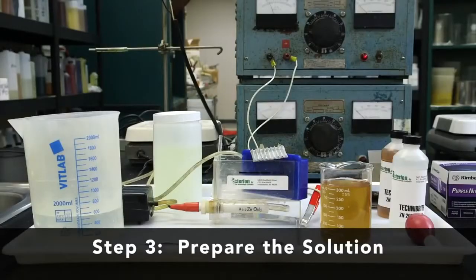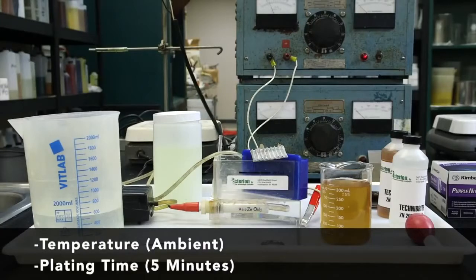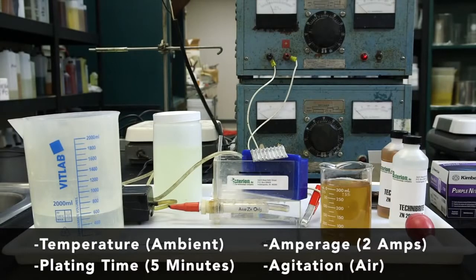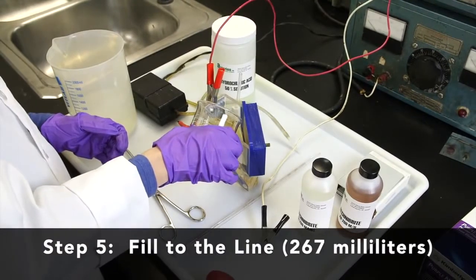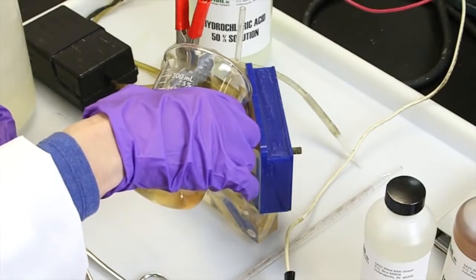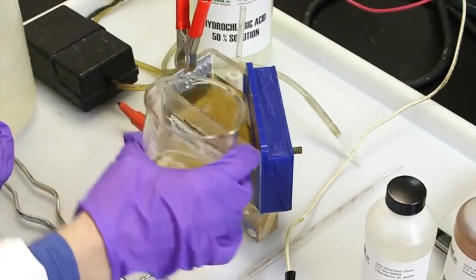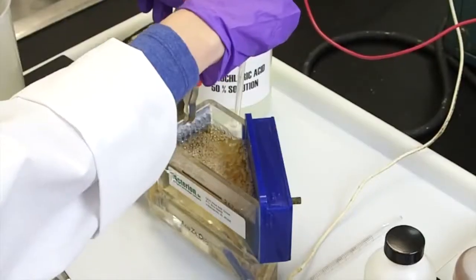Prepare the solution and document the following parameters: temperature — ambient; plating time — 5 minutes; amperage — 2 amps; agitation — air. Add the plating solution to the Hull cell and fill to the line at 267 milliliters. This is critical to achieve accurate interpretation of the results. Begin agitation of the solution — we are using an aquarium pump.